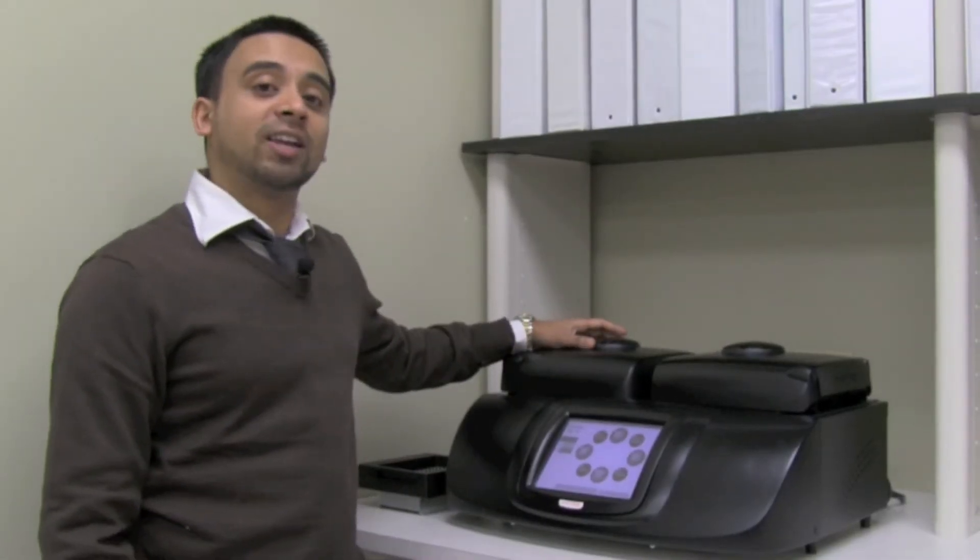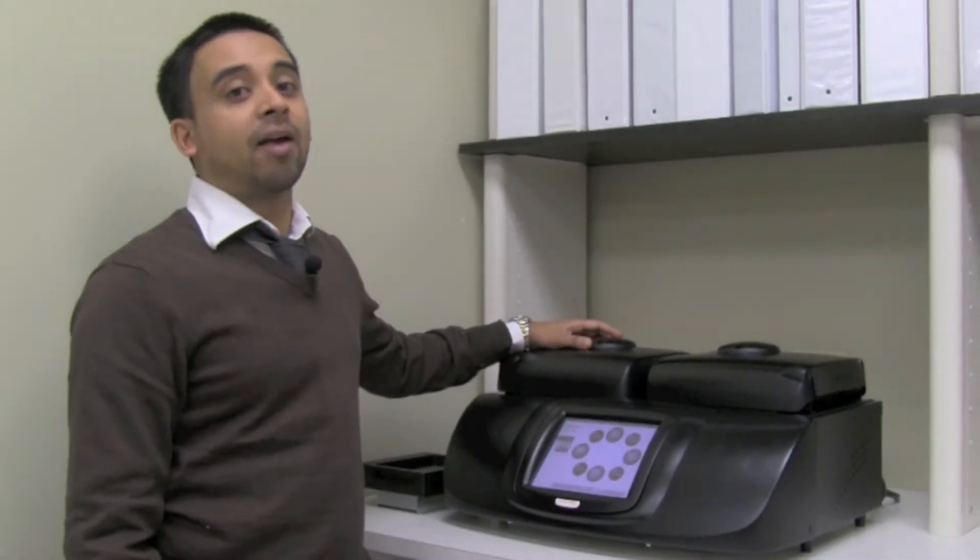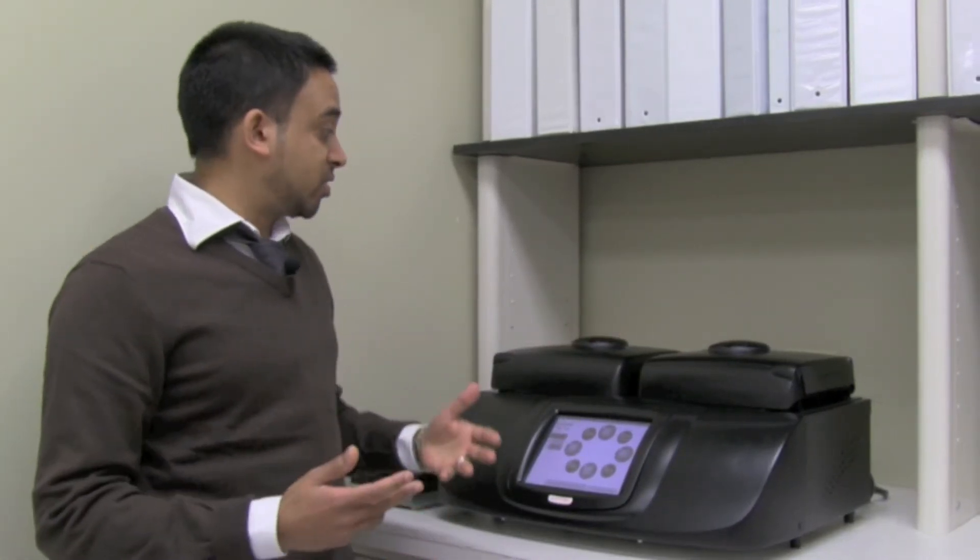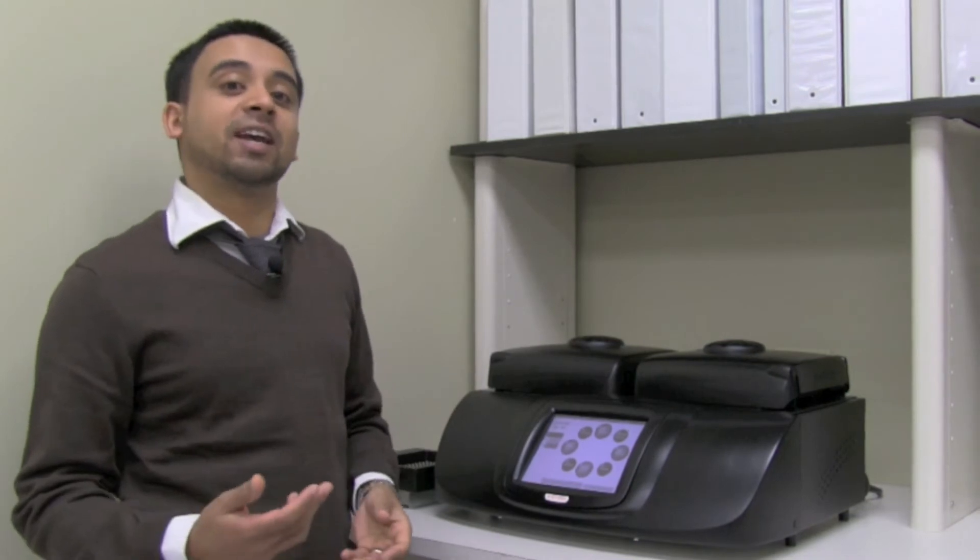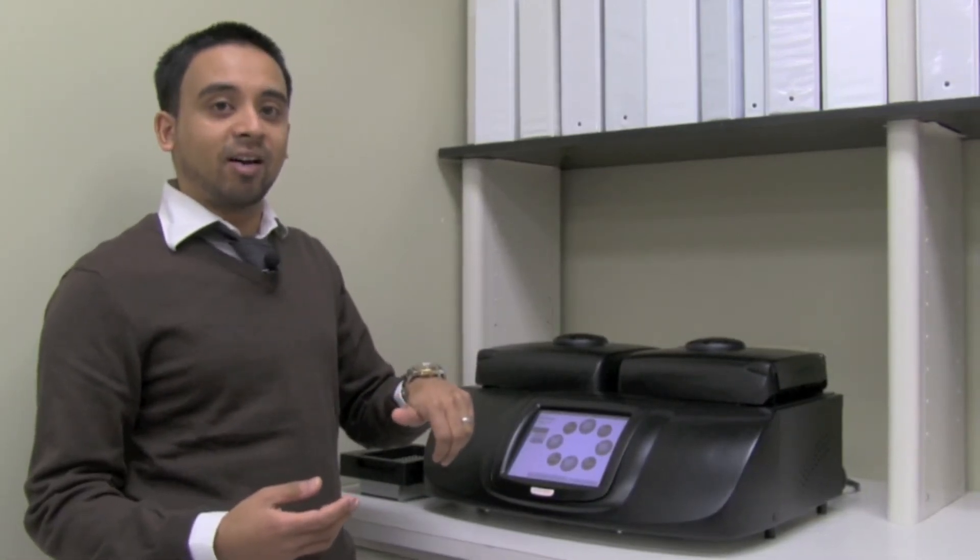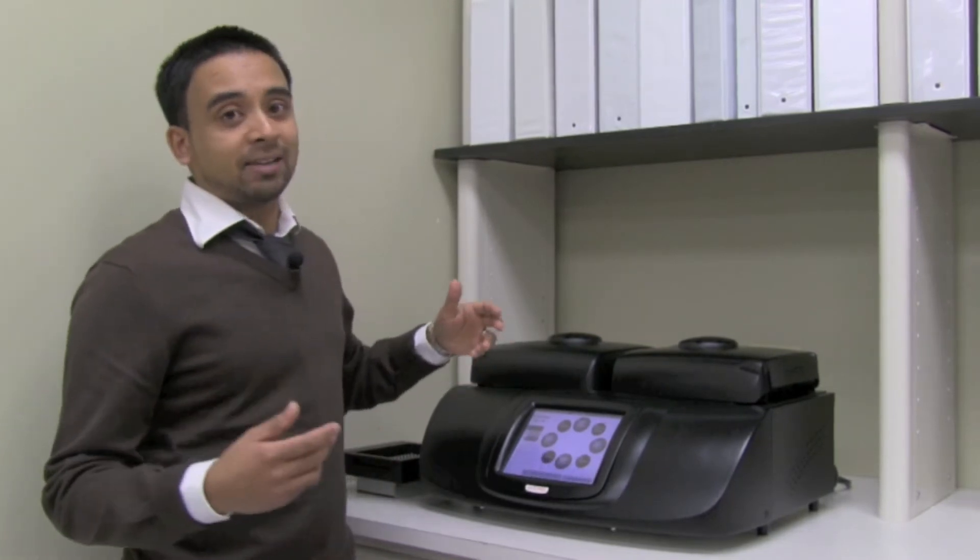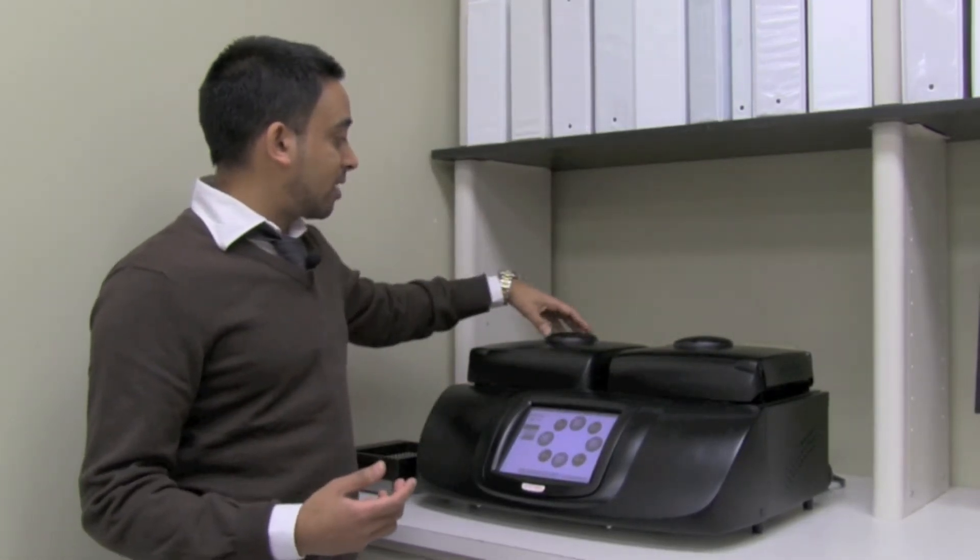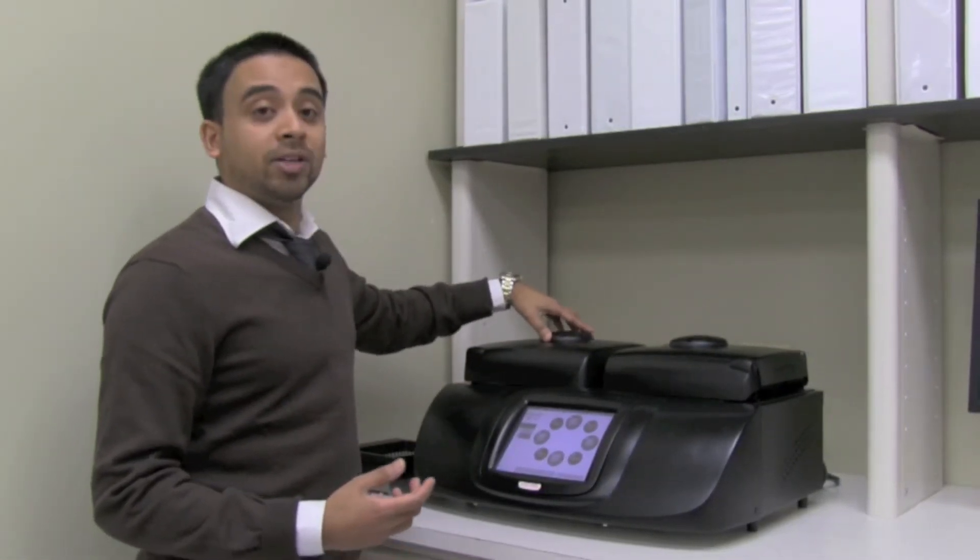The G-Storm has a turn-style locking lid that looks very similar to the Bio-Rad and the MJ Research locking mechanisms. However, this unit has some significant improvements and changes. With the Bio-Rad and the MJ units, it relied on a rotary locking system whereby you had to literally tighten the lid into place. This has got a slightly more advanced and better system. To unlock, simply turn and we're done.